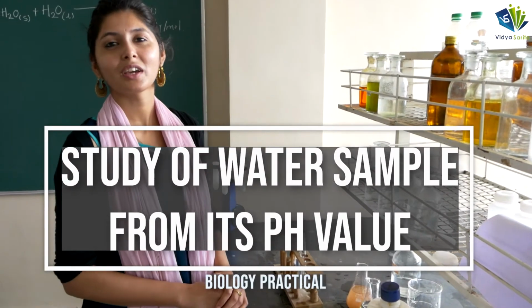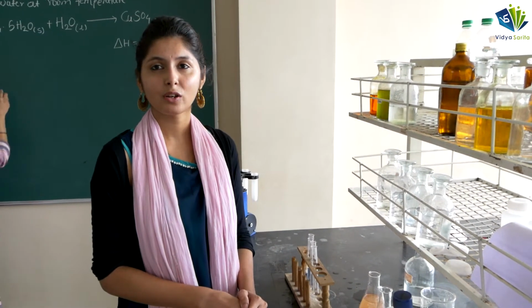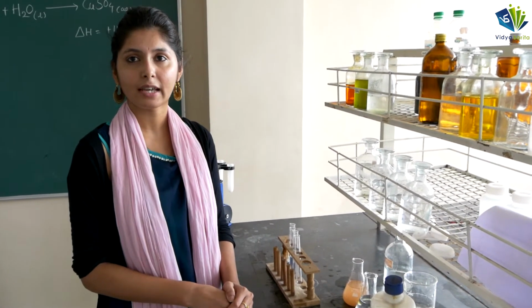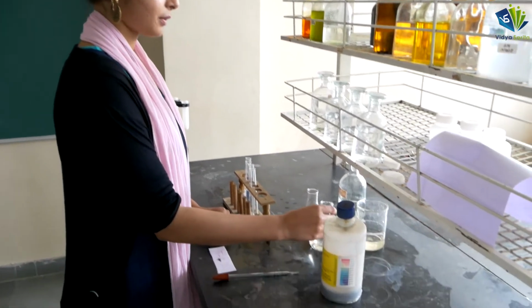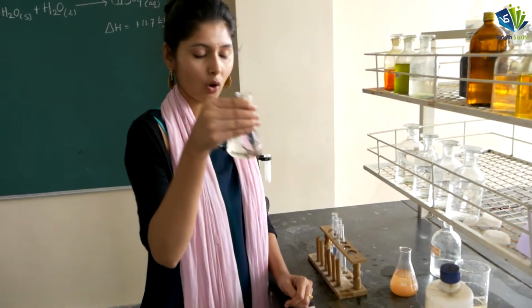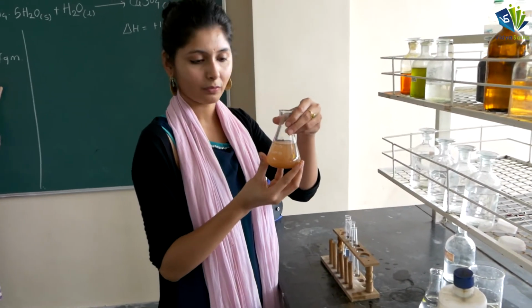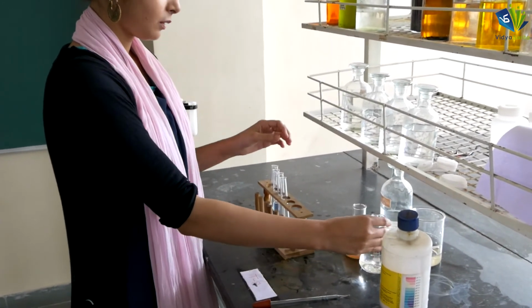Hello students, today we are going to do one practical, which is the study of water samples from different sites for their pH. We are going to find out the pH of two water samples collected from different sites. First is distilled water and this one is lake water. We are going to find out the pH of both.